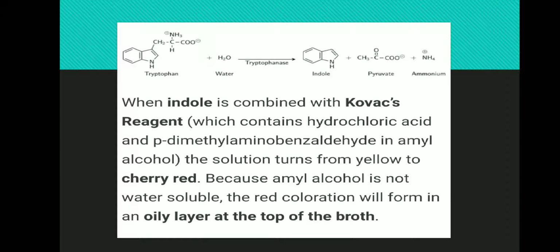In this, the Kovacs reagent is used, which contains hydrochloric acid and para-dimethylaminobenzaldehyde dissolved in amyl alcohol. Amyl alcohol is not water soluble, so the red coloration will form in an oily layer at the top of the broth.